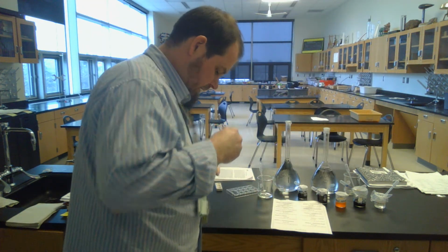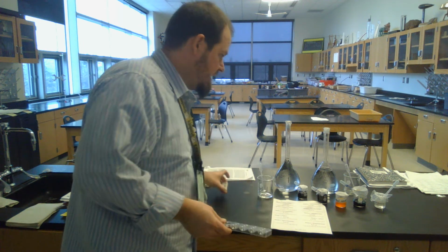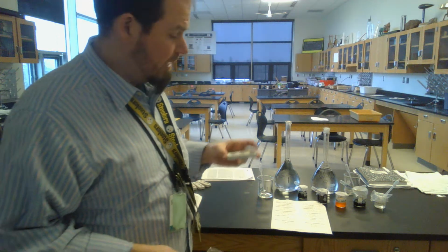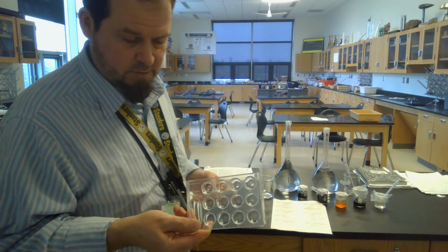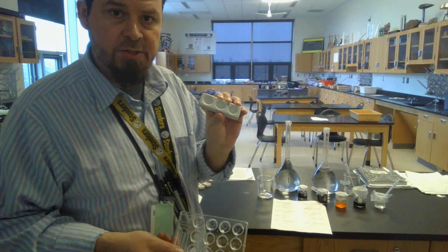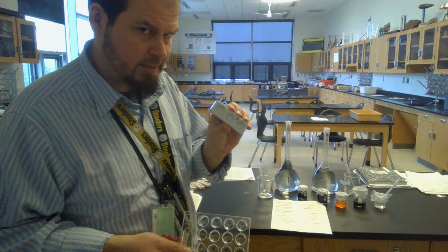And then this is another key piece I need to do. So phenolphthalein is super sticky. So I don't want you to test phenolphthalein on the clear guy. You can use this for everybody else. I need you to use the ceramic piece for phenolphthalein this year. I'm going to hope that it's not as sticky.